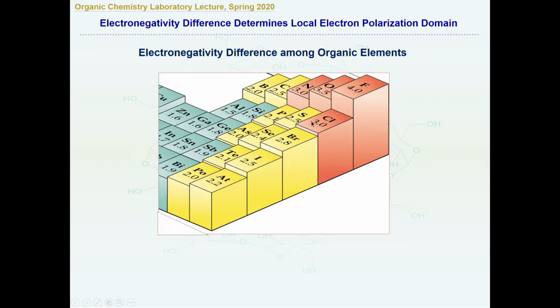For this reason, what we are mostly concerned with is the carbon and the proton linked onto the carbon. This is the proton NMR measurement. The electronegativity of proton and carbon is nearly identical, 2.5. So that's neutral, there's no pulling or pushing. But once the carbon is linked onto nitrogen, a C-N bond, or C-O, you can see the electronegativity is higher here.